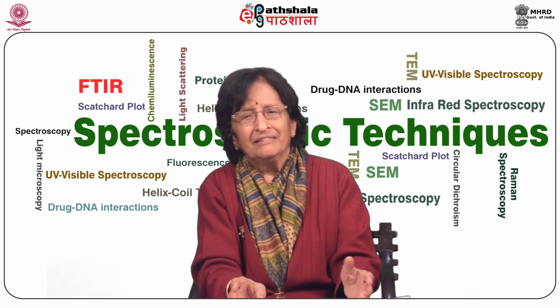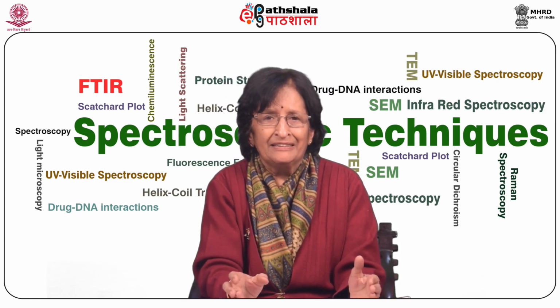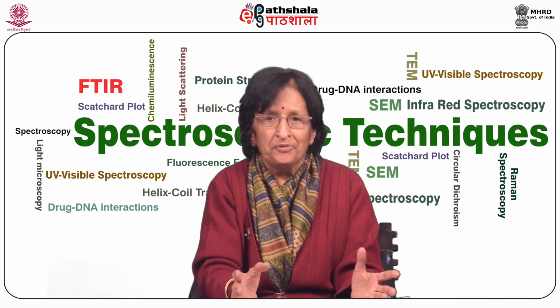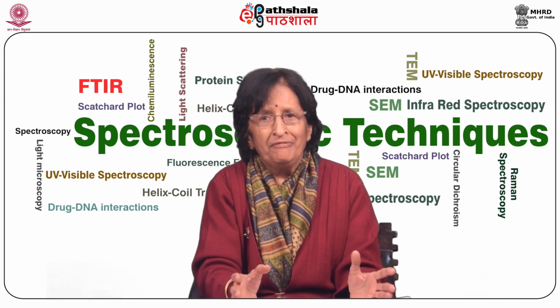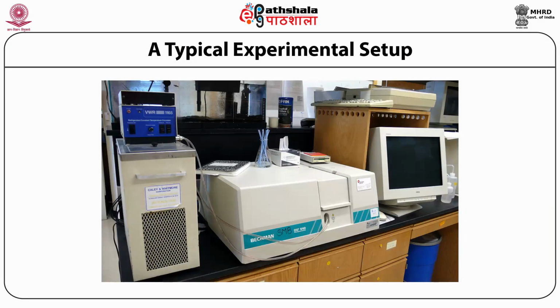Stray light, quality of optics like prisms, gratings, polarizers if used, they are very, very important factors for accurate measurements. We just show in this slide a typical experimental setup by Beckman, which is conventionally used in every lab.